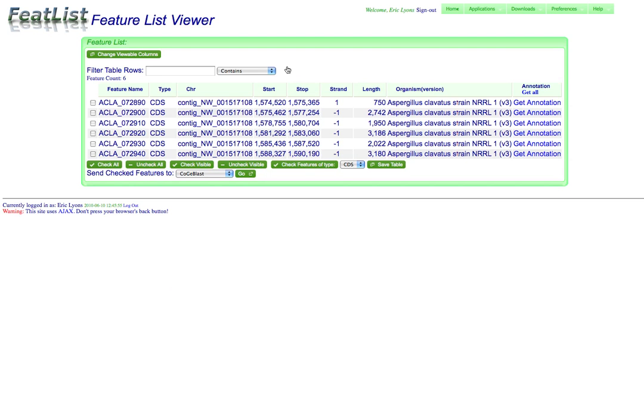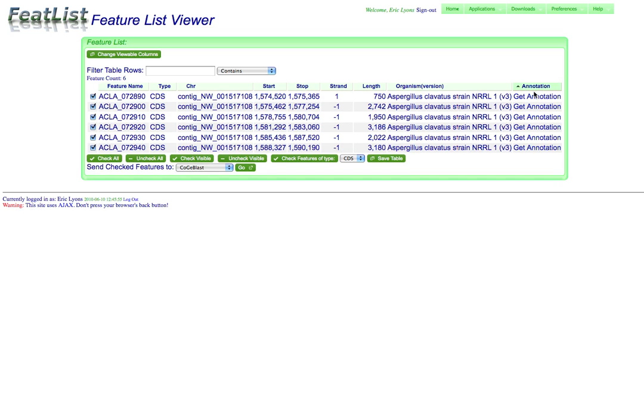Now we get a list of all the protein coding genes within that region here in FeatList. And from here you can send them to different tools like CoGeBlast. You can select them and get their annotations.